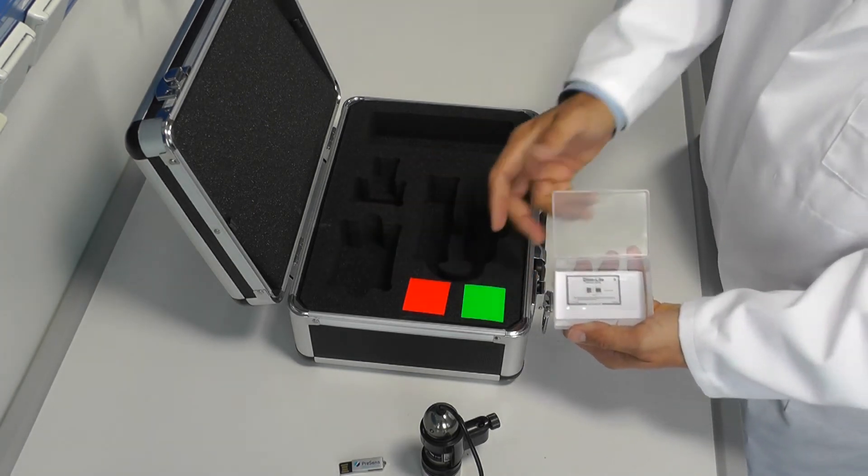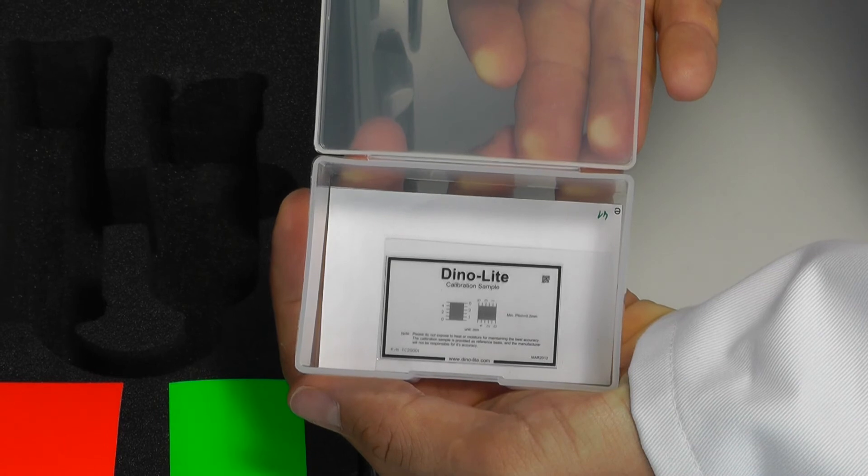There is also a transparent scale. With this, the respective mm to pixel resolution can be determined.